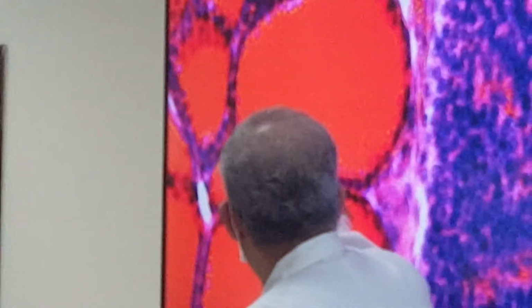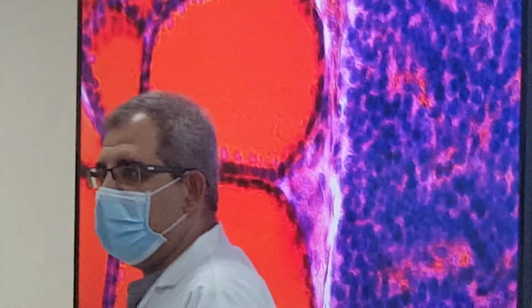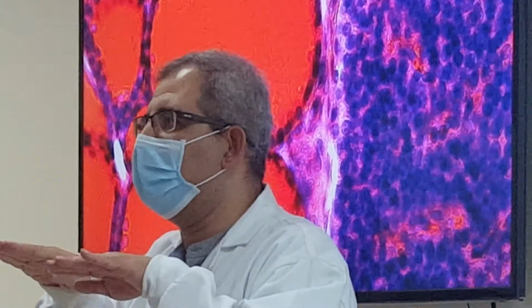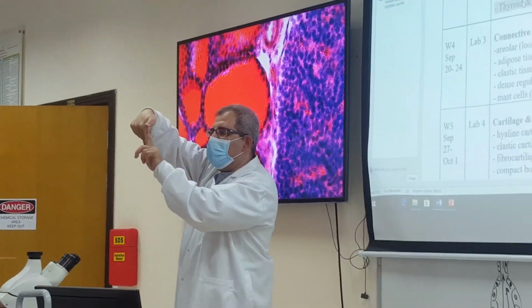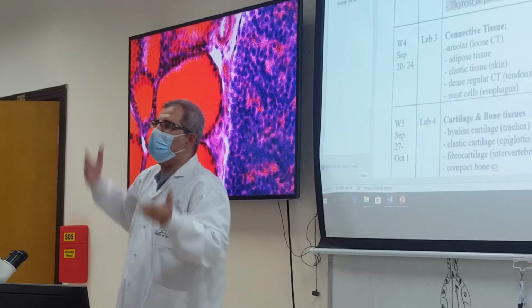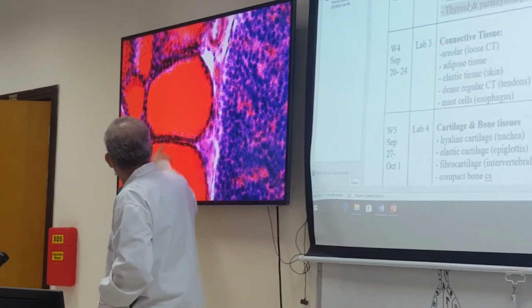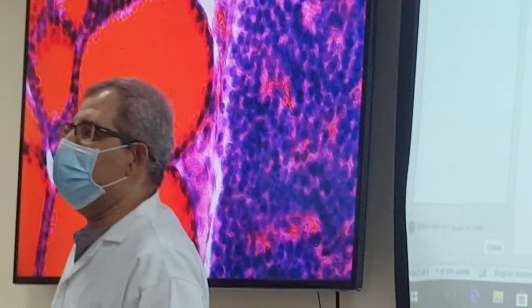They are like cube filled with the nucleus and the columnar epithelium. واضح? You should never really miss these ones together. Cuboidal, like a cube. Columnar, okay? It's a columnar, okay? So, definitely you are not going to miss it. Now, this is thyroid gland, and this is the cuboidal epithelium that you will see.